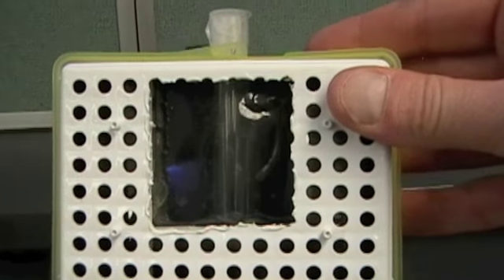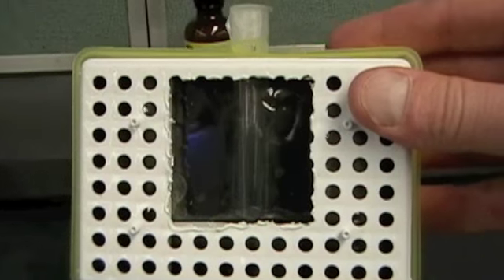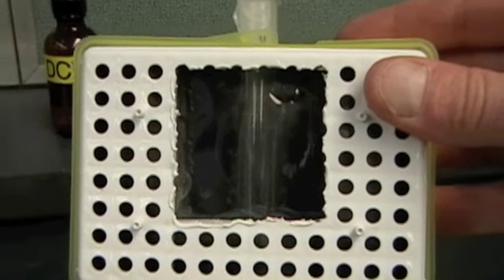And finally, this whole thing gets a lot easier at this point, because now when you put your chloroplast solution and your DCIP into this little box, you don't have to hold it there in front of the light for 10 minutes. You only have to hold it there for the standard reaction time. Whatever you calculated for your sample, that's as long as you need to wait.